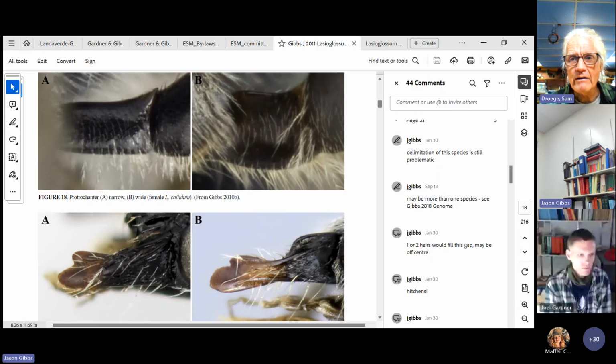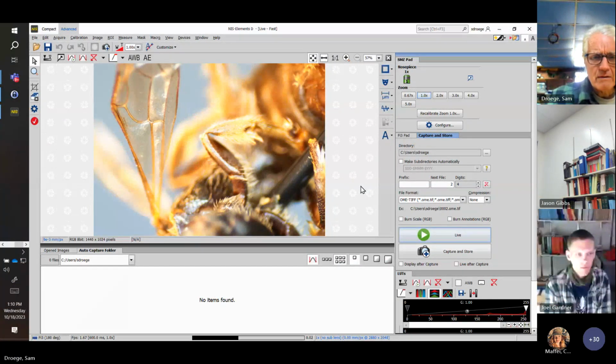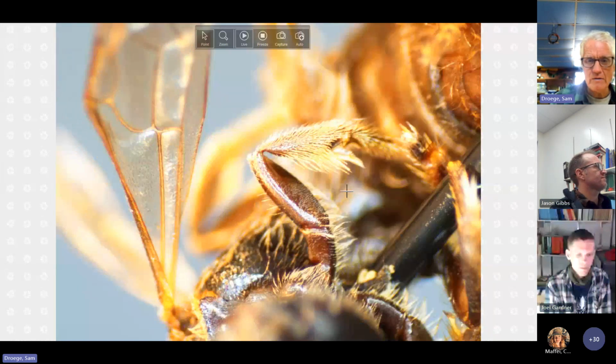All right, I'm going to share, and I have a trochanter on deck. Let me raise it up. It might need to be pivoted a slight bit, but you can see, in my mind, this is a really clear callidum trochanter. Sorry, we'll make it big. There we go.